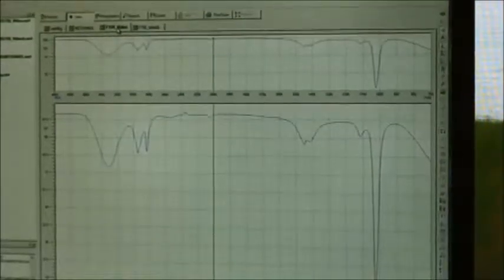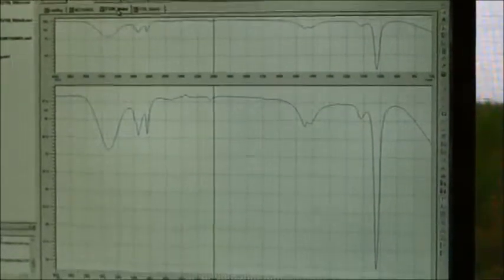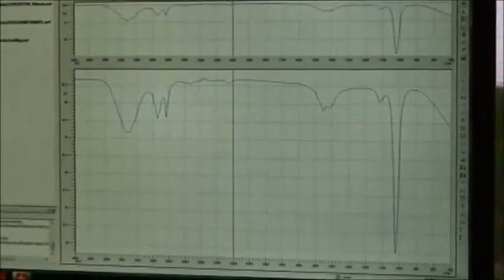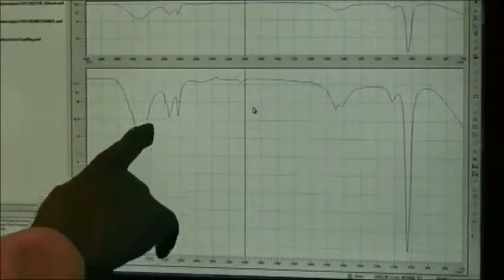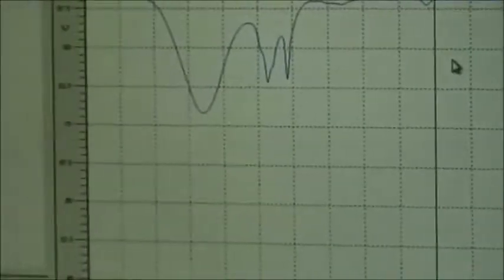Okay, so it's finished running and this is our beautiful spectra for methanol. So if you look here, this peak right here, round about, what is it? About 3,300. That's definitely our OH, bright peak for alcohol.